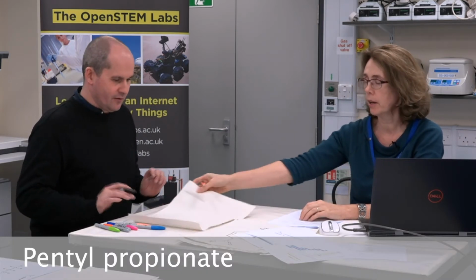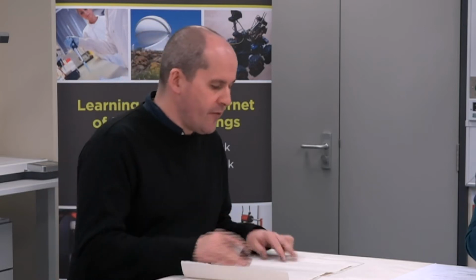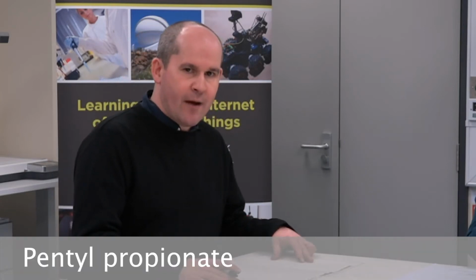Okay, right. So what we're going to do now is look at a different molecule. Yes, so we are going to look at pentyl propionate. Nick is going to draw this out so you know what it is, but this will relate to the next widget as well. The reason we chose this molecule is that I know that in the slidecast you look at ethyl ethanoate, which is an ester, and esters are quite commonly looked at as good introductory examples because of various features associated with them. So we're going to look at another ester, pentyl propanoate.